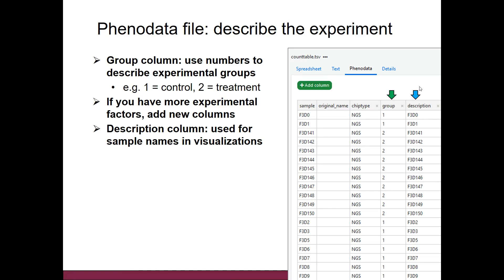The phenodata file is a very special file in Chipster because it's used for describing the experiment. You will have these columns there ready, but two of them will be empty. Particularly important is the group column — here you need to describe which samples belong to the control group and which were, for example, the treatment group. Rather than writing 'control' and 'treatment' here, we strongly encourage you to use numbers, with the smaller number always assigned to the control group. This is because the R-based tools after this are going to look at it, and for them it's easier to understand numbers.